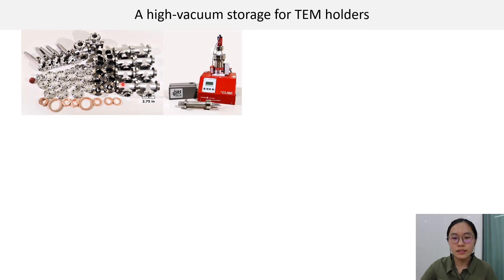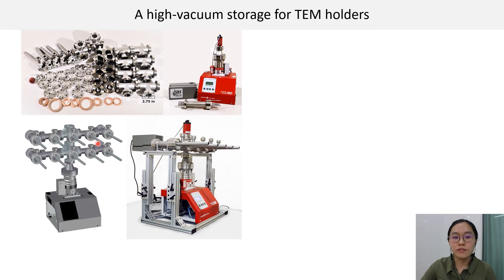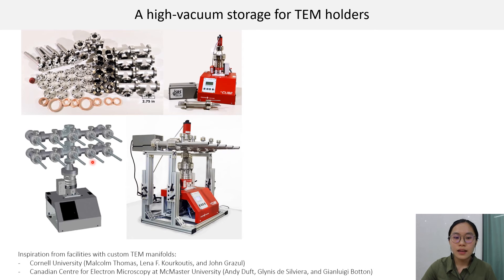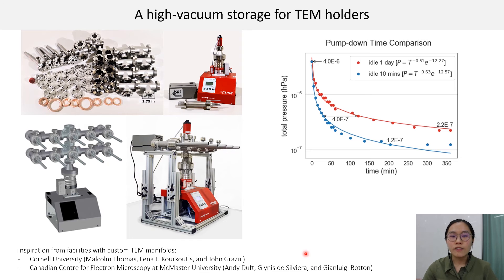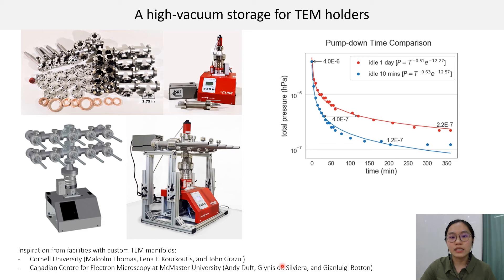The key components of the high vacuum manifold are an RGA, a turbo-molecular pumping station, and a total pressure gauge. The total number of holder ports can be customised to suit a facility's need. We would like to recognise inspiration from facilities with custom TEM manifolds, such as Cornell University and the Canadian Centre for Electron Microscopy. On top of their design, we added the RGA, which allowed us to assess residual gas levels specifically.